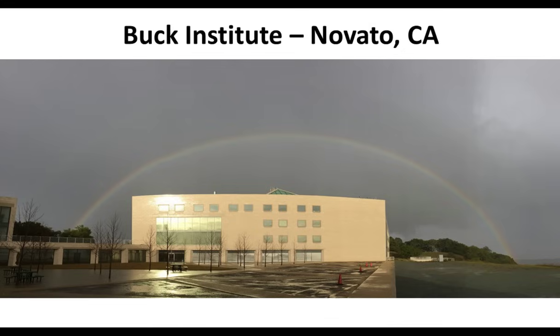We haven't done this for phosphorylation yet, although in the past other groups have done this kind of work, combining phospho-enrichment methods. So I do think that this is equally possible, and it might even be interesting to try and see if one can combine different classes of PTMs. I think there's a lot of space to explore these things and really look at PTM crosstalk and dynamics in particular.